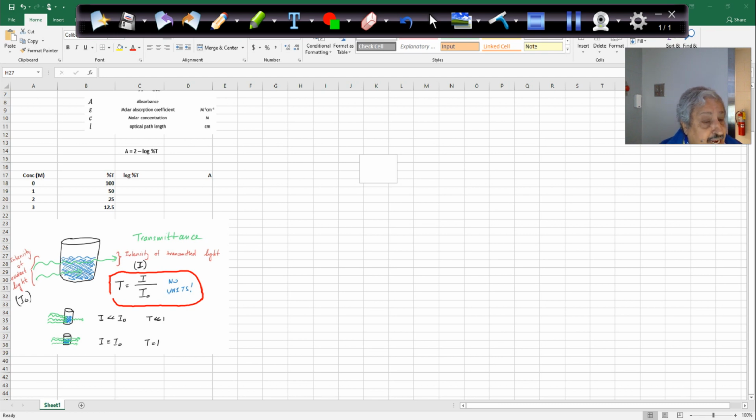Now, sometimes we say, okay, this solution is transparent. H2O is transparent, meaning it lets the whole light going in go out, it does not absorb anything. Some substances have no color, like H2O. If you put light on it, you get transmittance is 100%, is 1. And some color solutions, when you hit them with light, will absorb it, and the light intensity coming out will be less.